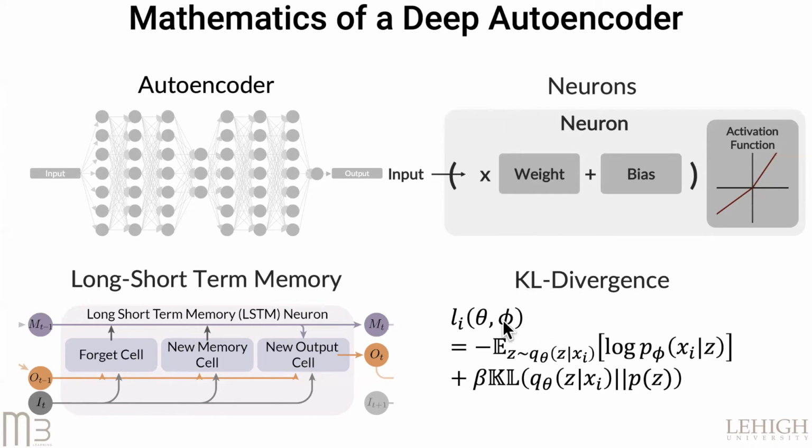So what this math essentially means, if you boil it down, is we have the second term, which is a KL divergence term, which essentially evaluates the difference between the output of this low dimensional latent space and some prior distribution, in this case a Gaussian, and then multiplies it by a beta term, which sets its magnitude. By tuning or optimizing this beta term, you're actually disentangling features, because as beta becomes large, you're forcing the latent space to become more and more Gaussian.